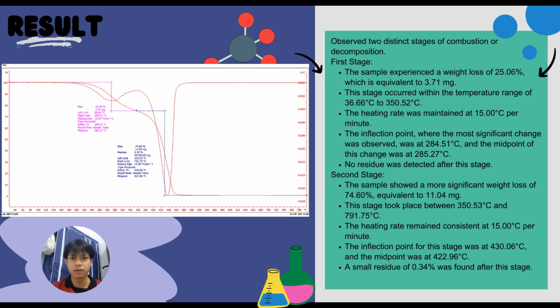This stage occurred within the temperature range of 36.66 degrees Celsius to 350.52 degrees Celsius. The heating rate was maintained at 15.00 degrees Celsius per minute.